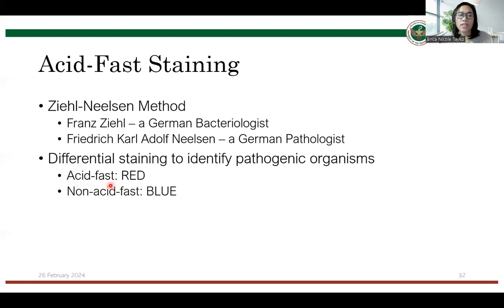So meaning primary stain siya. So meaning kapag acid fast, it will appear red. And then we use a counter stain. So once it is decolorized, we use a counter stain in the form of methylene blue. That's why yung mga non-acid fast, once they are decolorized, they would appear blue in color.